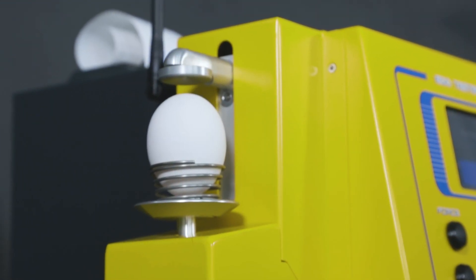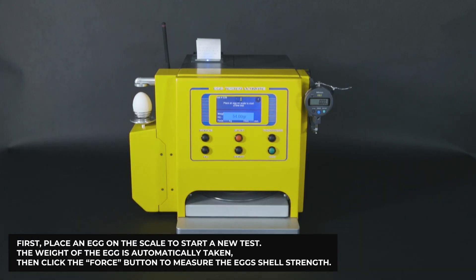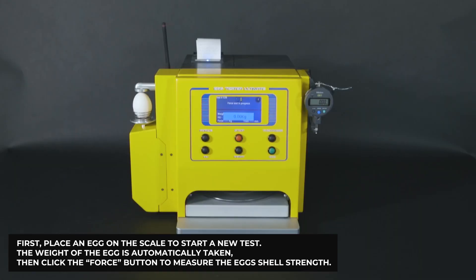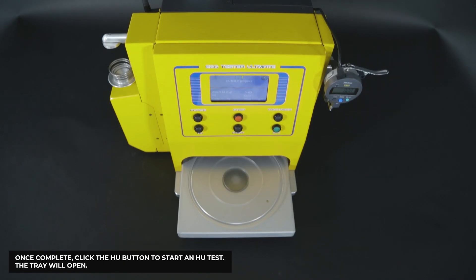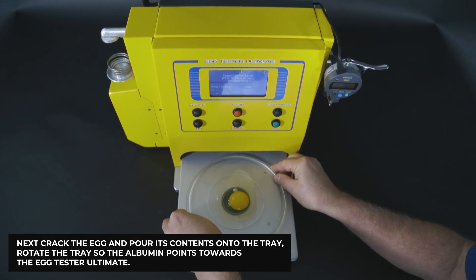It will get you a measurement in 17 seconds. First, place an egg on the scale to start a new test — the weight of the egg is automatically taken. Then click the Force button to measure the eggshell strength. Once complete, click the HU button to start an HU test, and the tray will open.